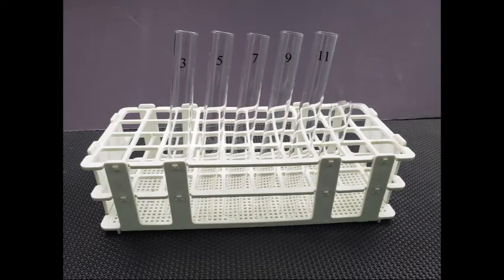Label five clean test tubes with the numbers 3, 5, 7, 9, and 11. This number represents the pH values of the chemical buffers that you will be using to control the pH at which your reaction occurs.